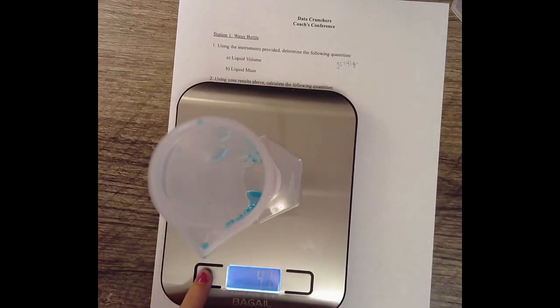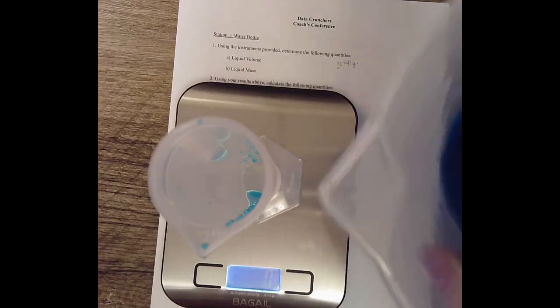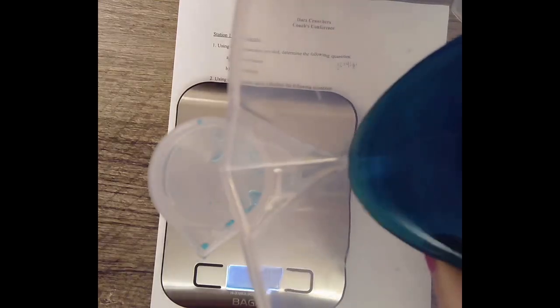I'm going to hit the on button, but just know that if you don't have an on button, or you can't reset your scale, you need to take note of this so you can subtract it out later. And now I'm going to pour my liquid in nice and carefully.